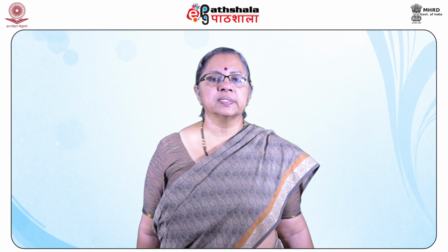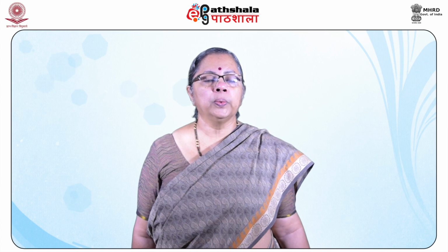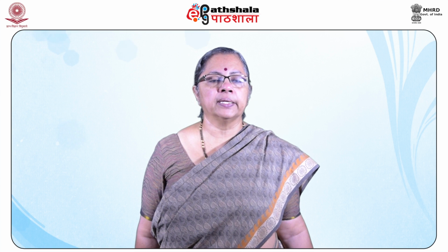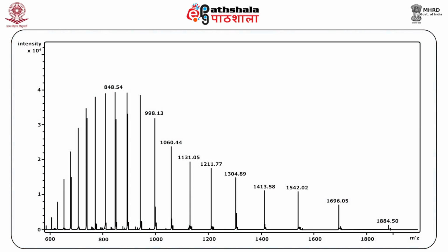The matrix such as gentisic acid is a UV absorbing weak organic acid which also acts as a proton donor to the peptide. How do we analyze a mass spectrum? In the indicated spectrum, the rightmost peak would correspond to the ion with the lowest charge, therefore highest m/z ratio.